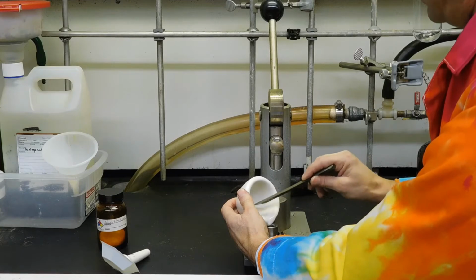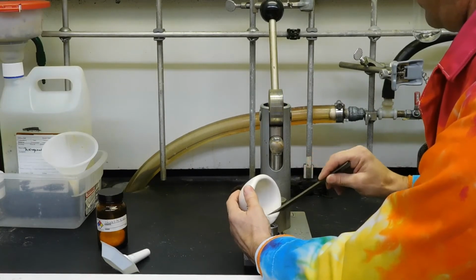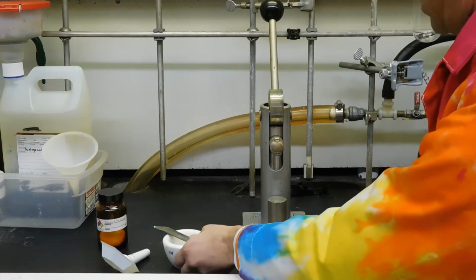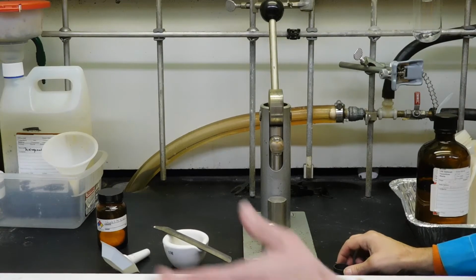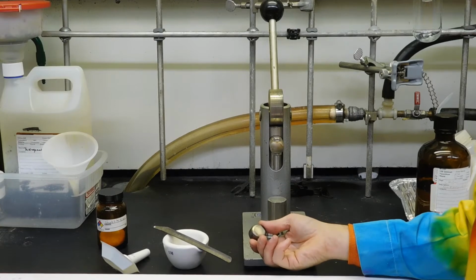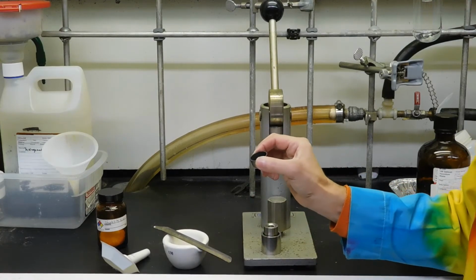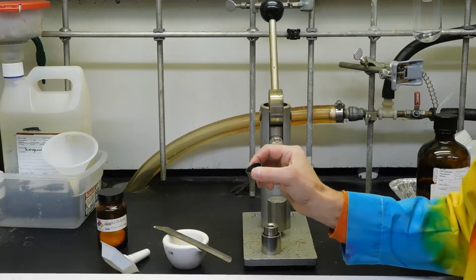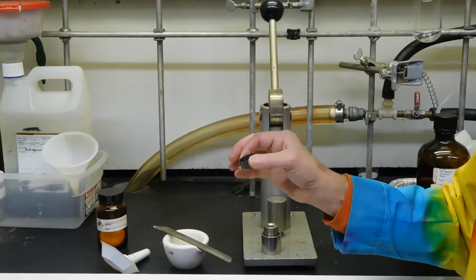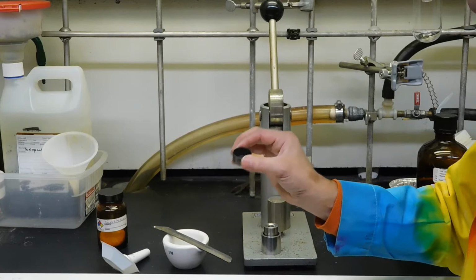So what I've done prior to making the pellet is, in addition to weighing the naphthalene powder on the analytical balance on the bench, I weighed this little cup, which is what we're going to put the pellet in to do the bomb calorimetry. I actually tared it on the balance just before I came to do this. So what I'll do is just take this back to the balance when I'm all done and see how much naphthalene I actually got into the pellet.